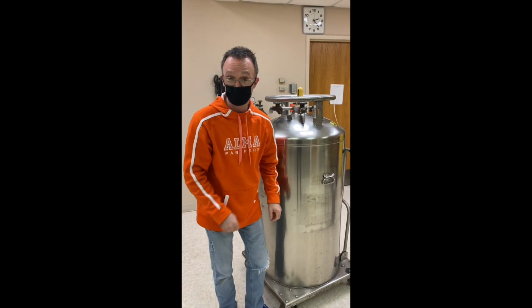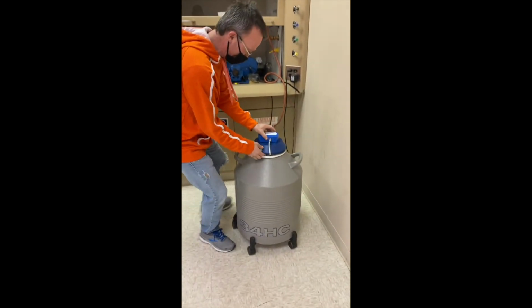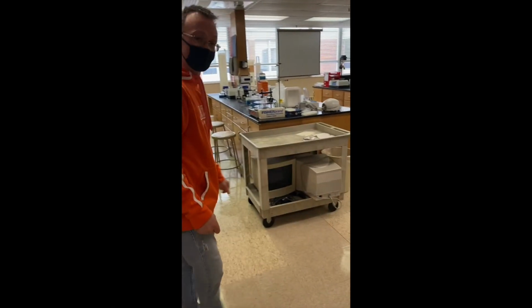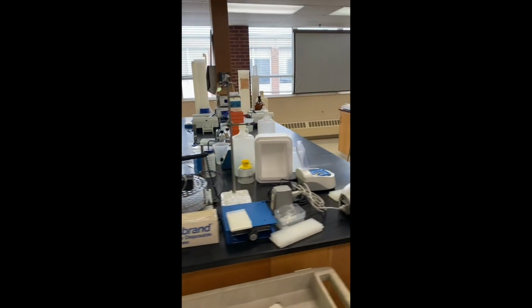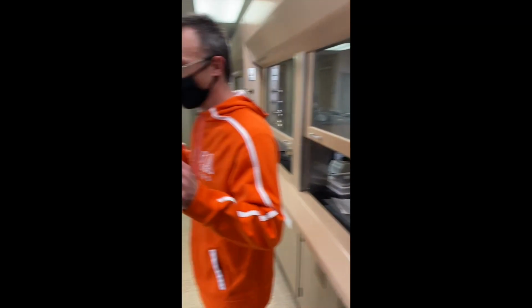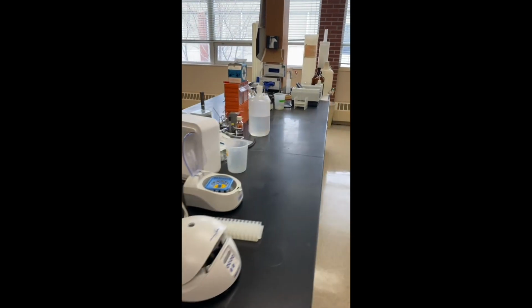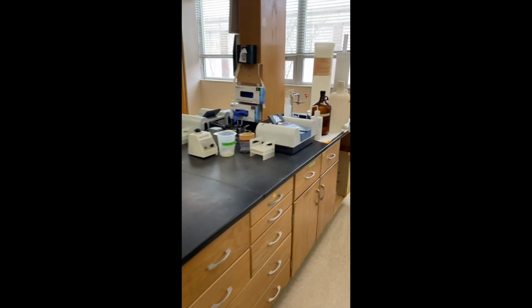One of the cool uses for liquid nitrogen is right over here. Our biology department and biochemistry department use this right inside here where they keep these cell cultures ultra cold. So here's one of our biochemistry labs. Our students generally take biochemistry in their 3rd year, sometimes in their 2nd year. It's kind of messy in here, but boy, these people do some really fantastic work. They all are tending to work independently on projects. Almost all these stations are set up the same with fluorimeters, their own centrifuges and vortexers, all kinds of cool stuff.